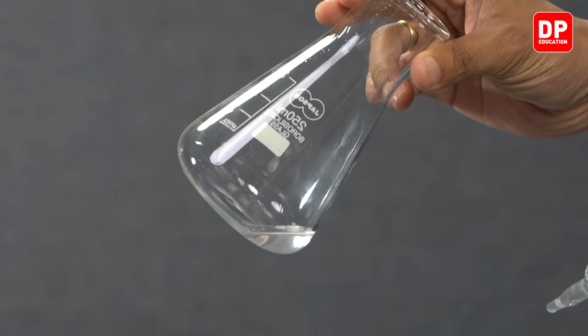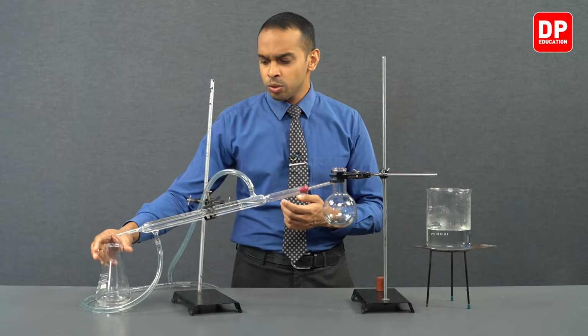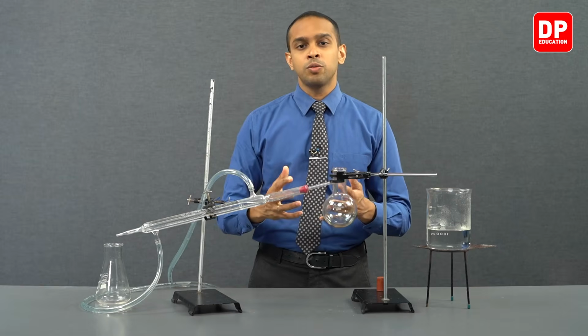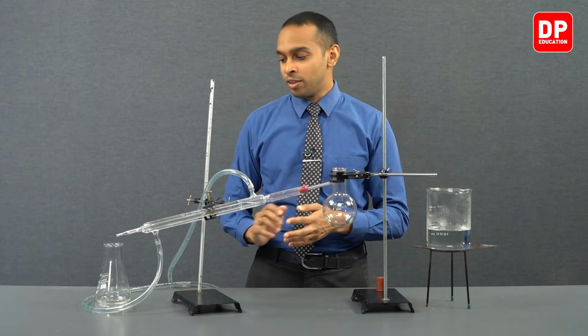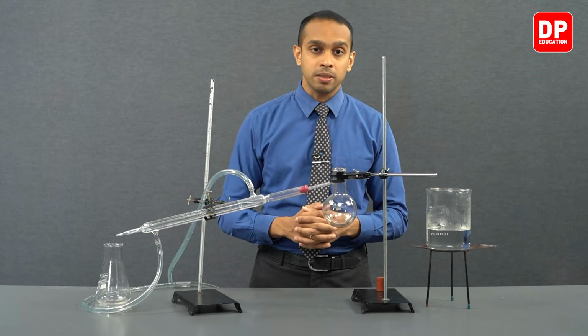Majority of the diethyl ether was evaporated as it is very volatile. So even after getting it collected in this Erlenmeyer flask, you would observe that the diethyl ether quickly evaporates and only a very small amount is still remaining in our Erlenmeyer flask.